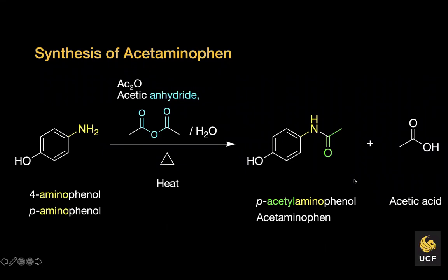Okay, so in this week's lab, it involved the synthesis of acetaminophen. It's the active ingredient in really hundreds of over-the-counter drugs, as well as prescription medications. You may be familiar with it from Tylenol, right? Or sold under the brand name Tylenol. But it's also an active ingredient of many different medications.